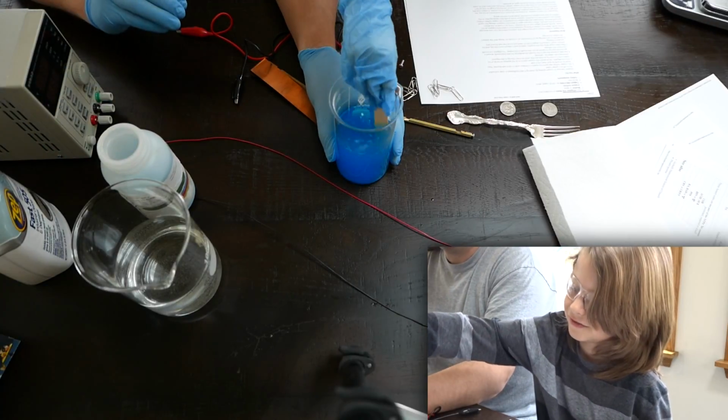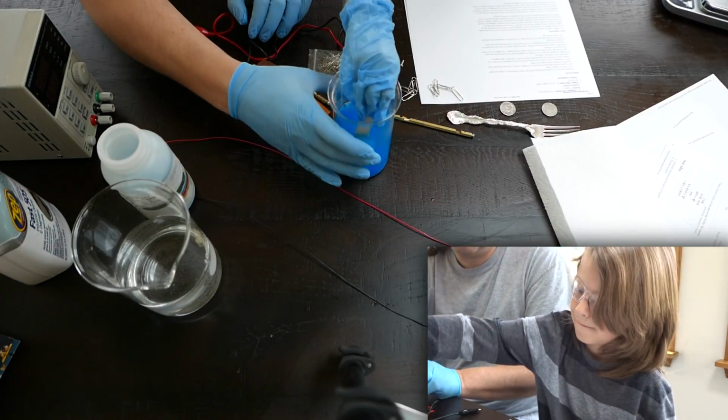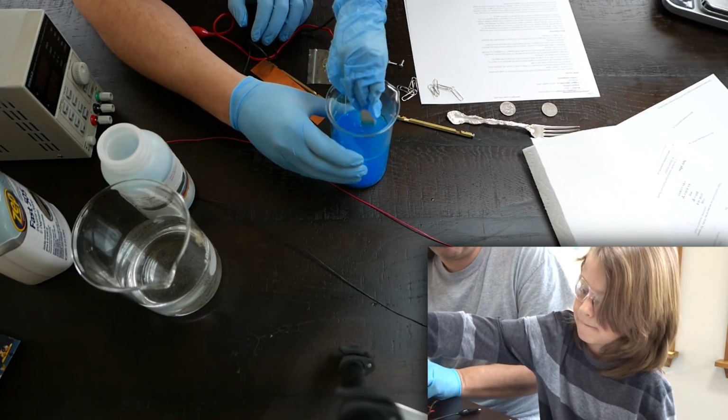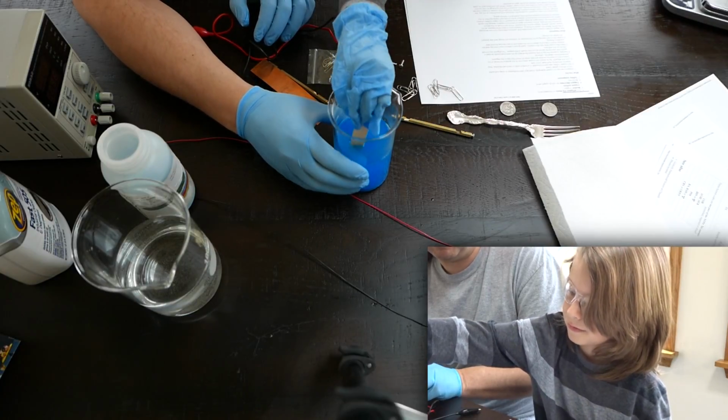Can I see if they're dissolving? Yeah. I can't see them. You don't want to get your fingers in there, okay? Because if you get your fingers in there, we're going to stop and put new gloves on, okay? Okay.